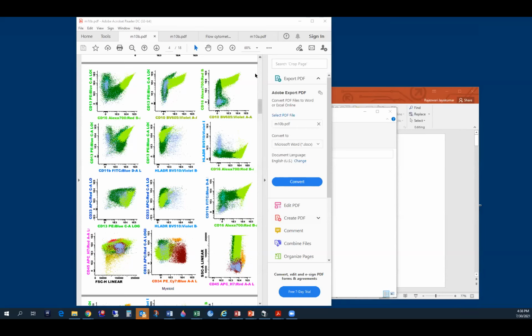Okay, so this is similar to what Akanksha showed in our regular practice. When we were fellows, our attendings taught us some shapes that we remember. For 13 versus 16, they used to say it is in the shape of a Nike swoosh, like the tick mark sign you see on Nike shoes.